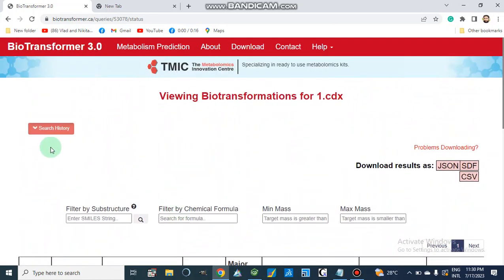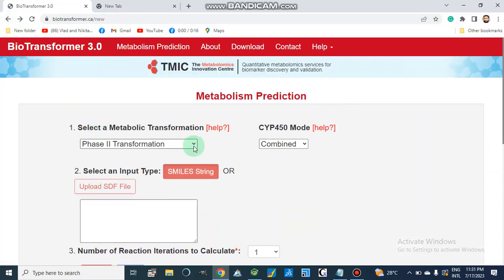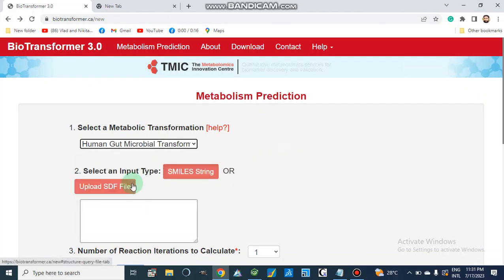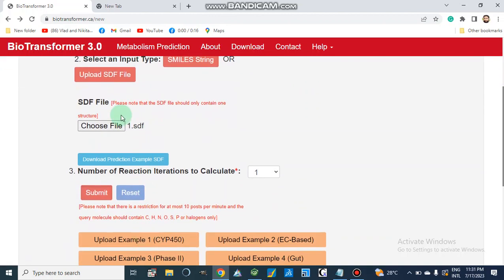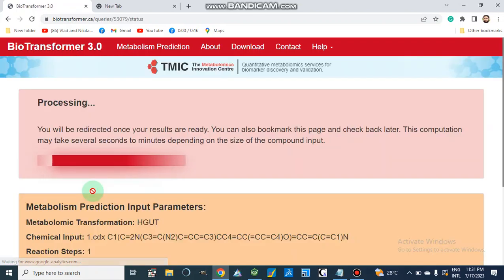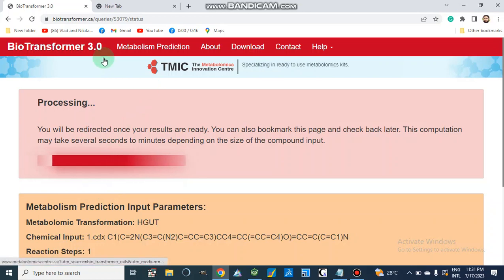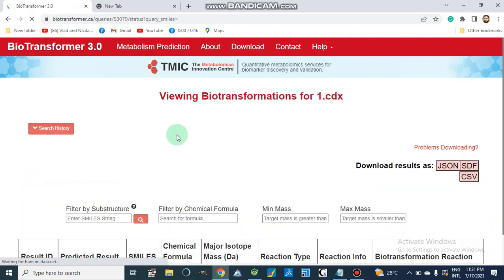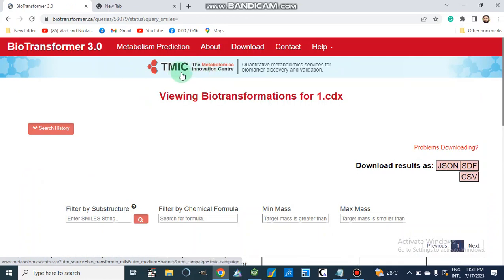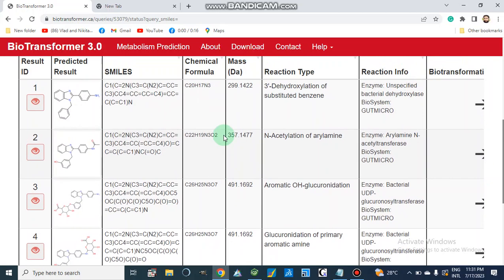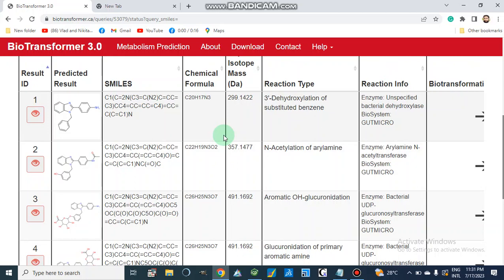Now we can check other parameters as well. After going back, we can select how human gut microbial transformation will occur for this file. Again it is an SDF file; we submit and after processing it will give us results. This online tool is available from the Metabolomics Innovation Centre. Here is the result of degradation inside the human gut.